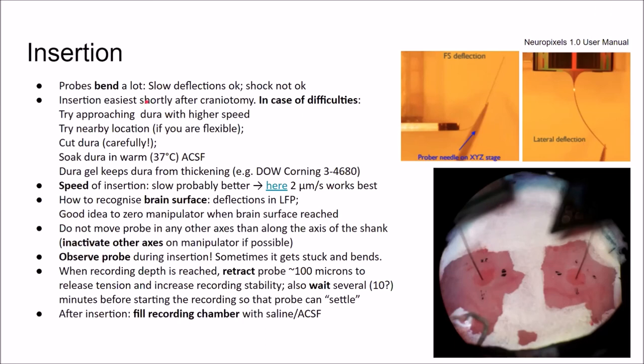But the point is that it could be quite difficult to enter the dura because of this flexibility. So it's easiest if the dura is fresh, shortly after craniotomy. But if you have difficulties, you can try approaching the dura with a higher speed, for example. This sometimes helps. You can try a nearby location if there was some dura growth on the particular location you want to go. You can also cut the dura, but of course just like with a needle, with a hypodermic needle. But you have to be super careful, especially if you want to record from neurons on the surface of the brain. Other people I read said you can soak the dura in warm ACSF just for a few minutes. This makes the dura more flexible. Or you can use dura gel, which you apply shortly after the craniotomy. And then you can go with your probe through this dura gel.